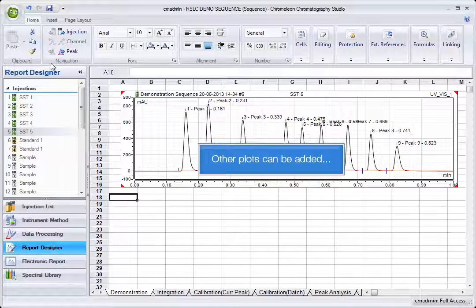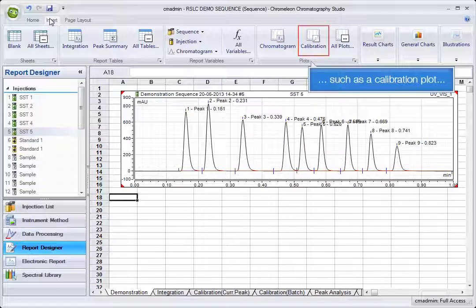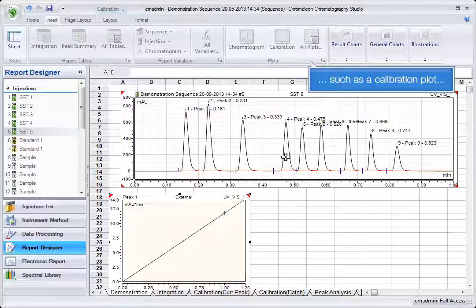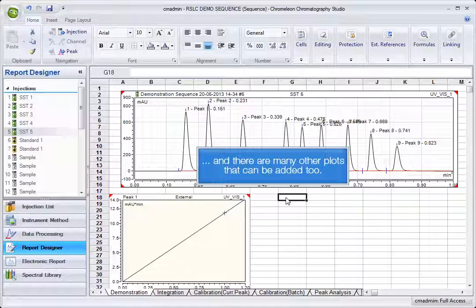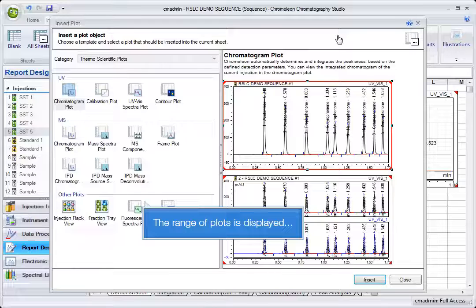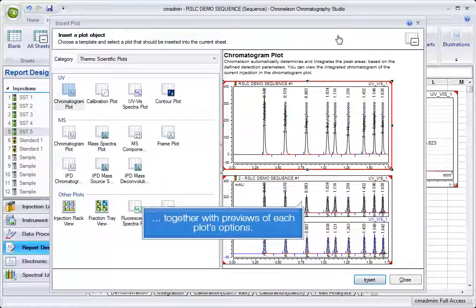Other plots can be added, such as a calibration plot, and there are many other plots that can be added too. The range of plots is displayed together with previews of each plot's options.